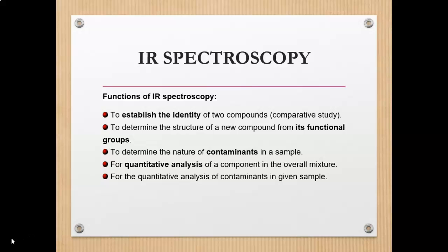So in the modified polymer, you will have a new peak, which is Si and also OSi, together with the OH, right? So you can make a comparable study of the presence of OH in the unsaturated polyester resin. It means that coconut shell is homogeneous or well dispersed in the polyester resin. So the modification is a success because of the presence of the new peak in the polyester resin.